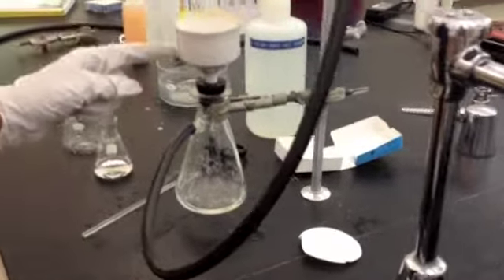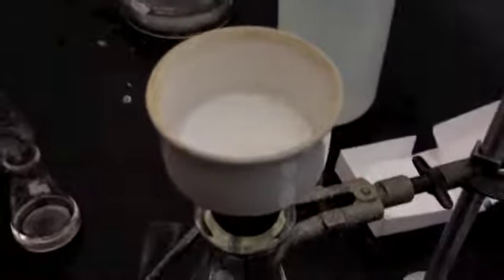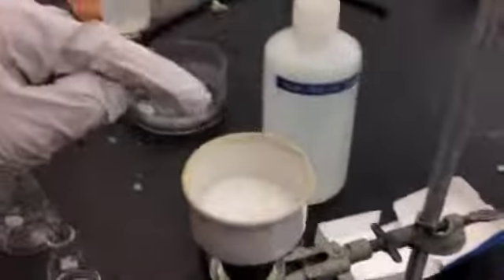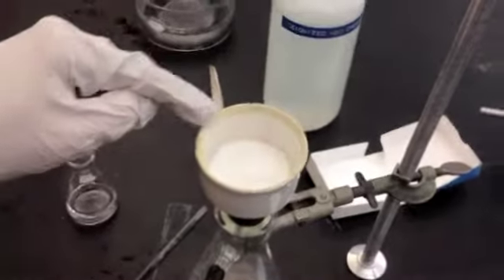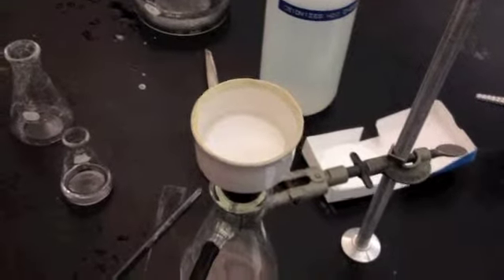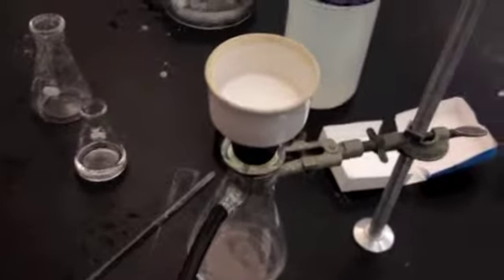So after this is done, you can take out the filter paper just using a spatula and you can weigh it. Now it would be good to probably pre-weigh your filter paper in order to be able to tell how much your product actually weighs, and then you can calculate your yields after that. That's basically how you do a recrystallization using one solvent.